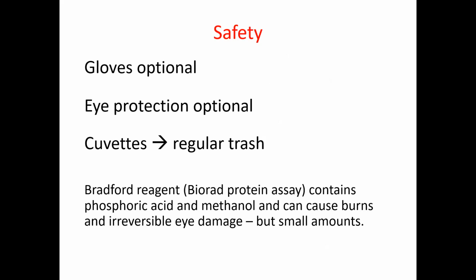Finally, today, gloves are optional, eye protection is optional, cuvettes will go in the regular trash. The Bradford reagent, also called the Bio-Rad protein assay, does contain some phosphoric acid and methanol. It can cause burns if you dangle your fingers in it for a long time, and irreversible eye damage, but you're using small amounts. You're welcome to wear gloves or eye protection if you want to.